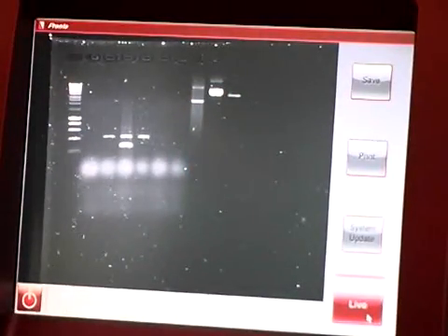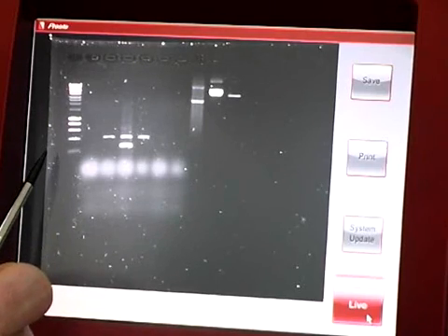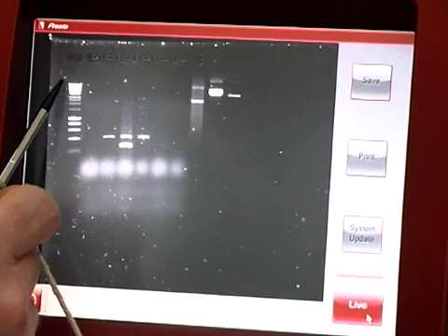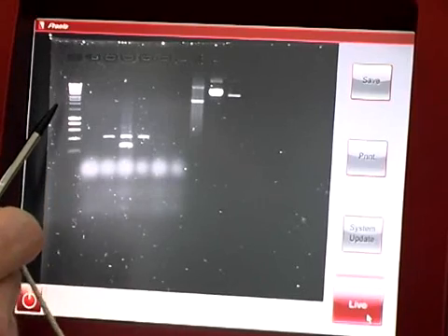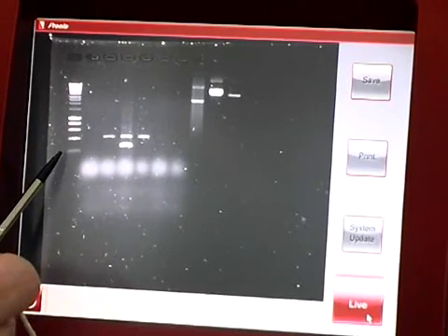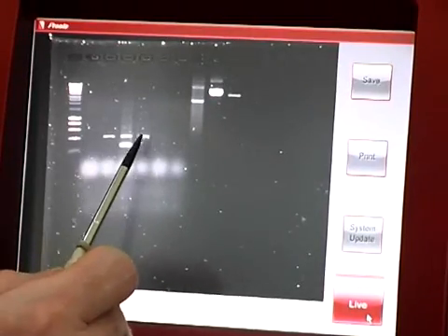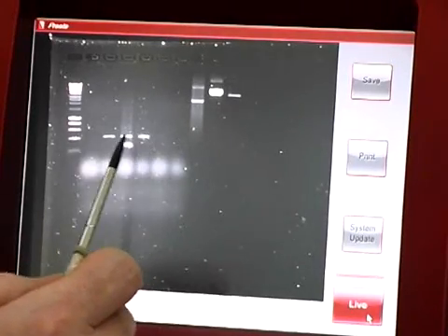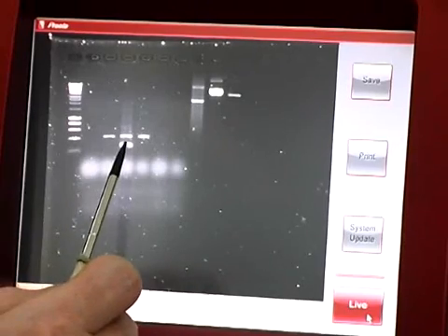Here we have an image of the gel focused and the bands are fluorescing in the UV light. On the left we have the reference ladder with known DNA sizes from 10 kilobase pairs down to 100 base pairs. You can see that the smaller base pairs move the furthest. Of the six samples which are loaded, three are showing bandings. These three have bands just over 200 base pairs and the one in the middle has 150 base pairs as well.